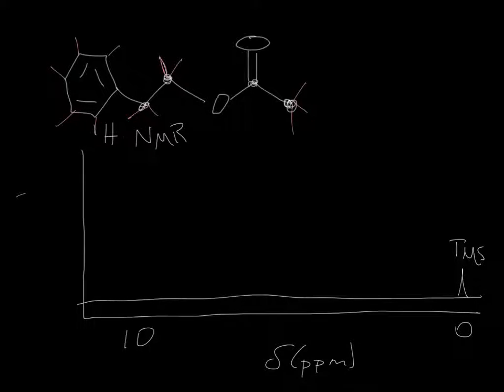It's not as far as a carboxylic acid, but it's not going to be like the methyl group. Methyl groups are really, really close. It doesn't matter to me where you put it, but it's probably not that far downfield. We already said it's going to integrate to 5. Notice that I drew it as a singlet.